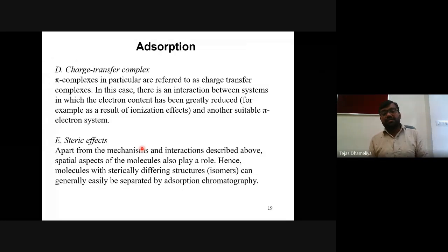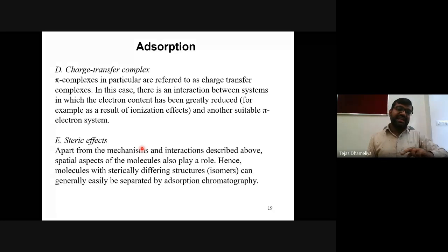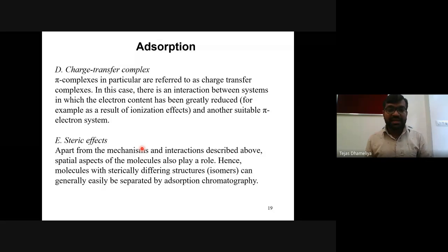Here molecules are also interacting with other molecules through several types of relationships. These interactions can be hydrogen bonds, electrostatic interactions, pi-pi interactions, pi-cation interactions, or steric effects, which are also a kind of interaction between molecules.